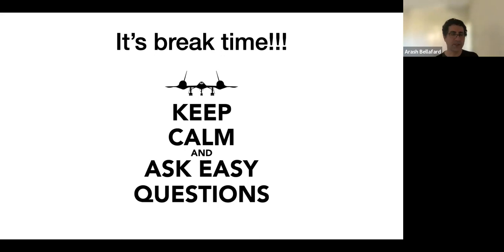Fangling, I had a quick question. Yes, go ahead. How does MERFISH compare to HCR FISH? Yes, good question. Short answer is I don't know. I know quite a lot about MERFISH, but I'm not specifically sure about the HCR FISH you mentioned. HCR is an amplification method, is it? I think it's multiplexed hybridization chain reaction fluorescent in situ hybridization.